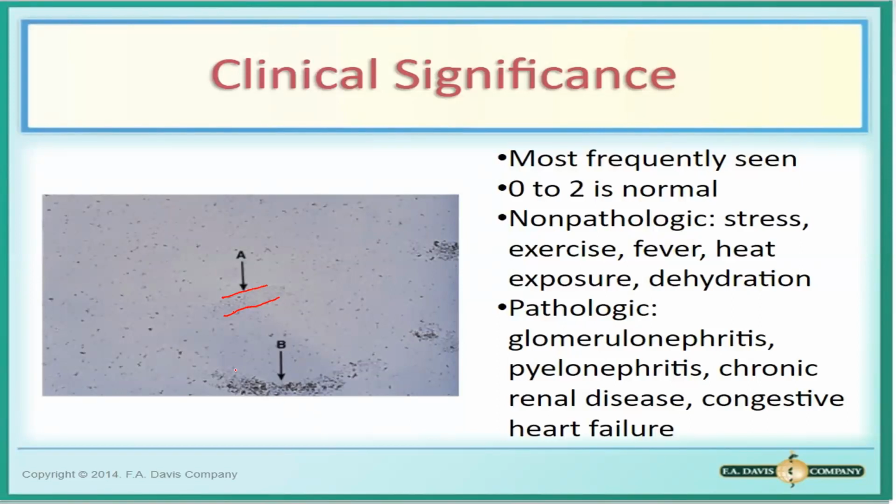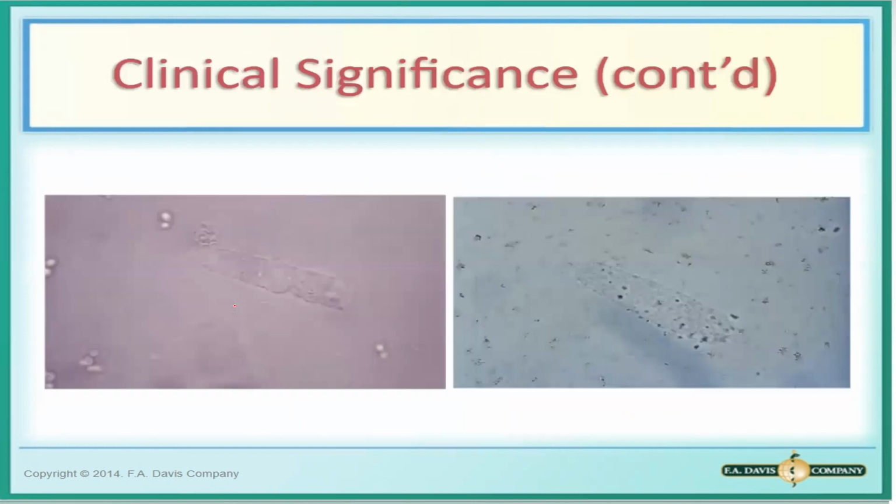Itong B, hindi definite yung kanyang sides, and hindi rounded ang edge. Open edge siya. So, this is not a cast. Parang nag-clump lang yung amorphous spheroids niya. Ito yung cast natin. Another example of casts: hyaline cast.